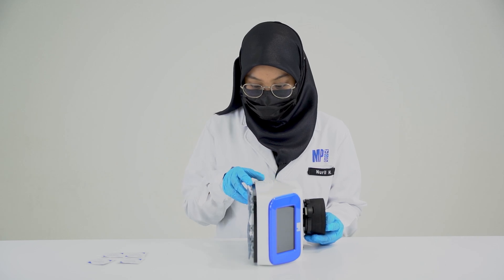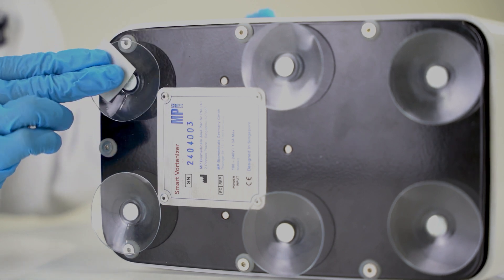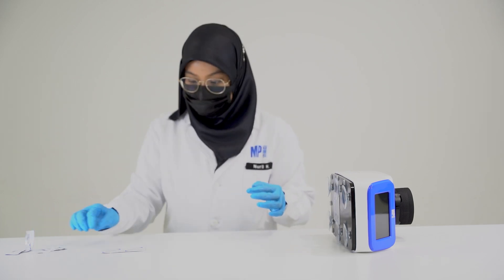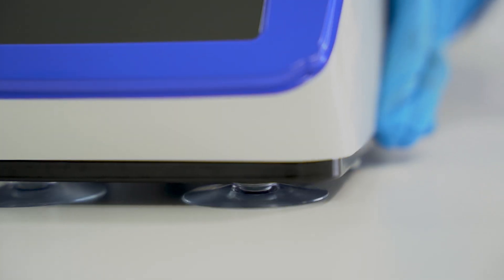To prepare the Vortanizer for operation, wipe off any dust particles using an alcohol wipe on the suction cup and the surface. Ensure the surface and pads are dry before placing the Vortanizer down. Make sure the Vortanizer is firmly attached to the surface.